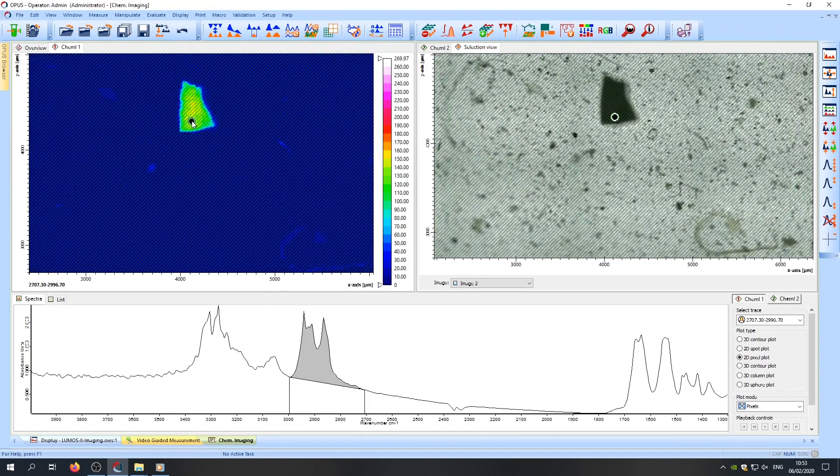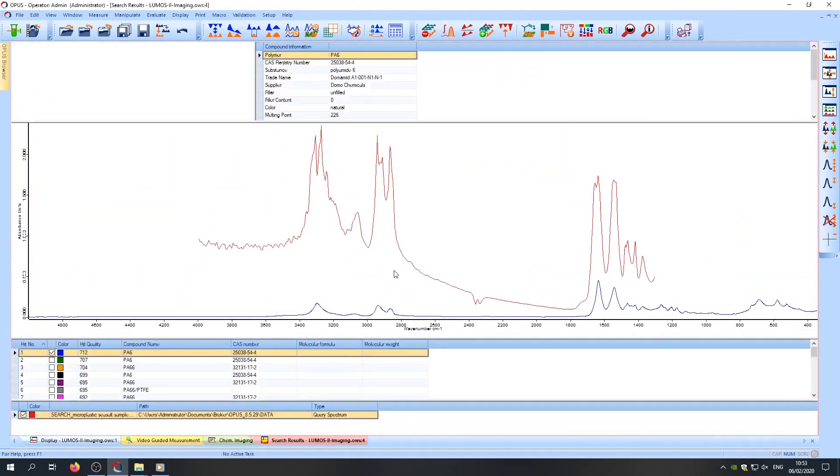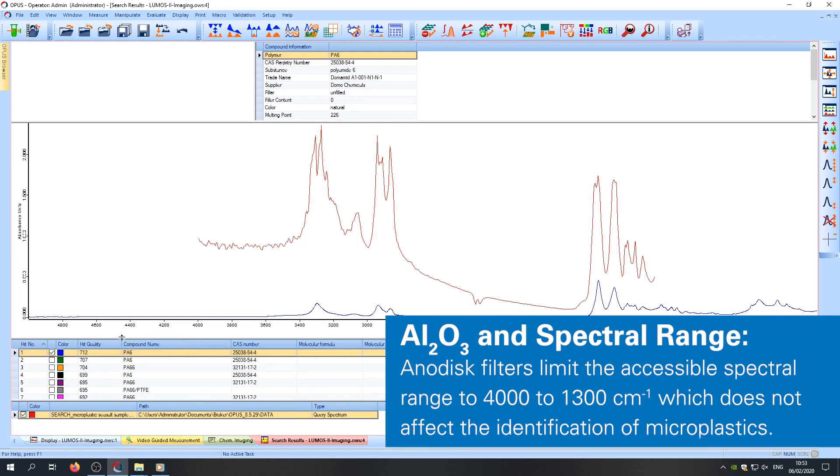Just by clicking on the particle, we are shown the corresponding spectrum and if we want to identify the particle, we just perform a library search. The suggested identity of the particle is displayed here and in this case, we can be sure that it's polyamide.